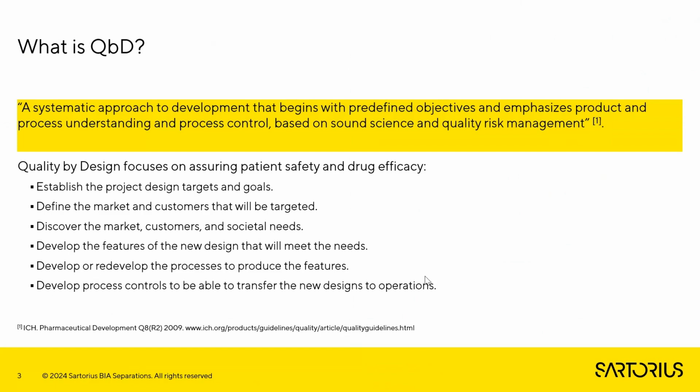Before I go into experimental results, of which there will be quite a few in the slides presented, I do want to pause to ask the fundamental question underlying this presentation: what is QBD? What is quality by design? A simple or simplified answer to this would be that it's basically a systematized approach to development, meaning we do not do research for its own sake. We have a very precise set of goals where we want to get to and how, and we set out at the beginning how we plan to get there.